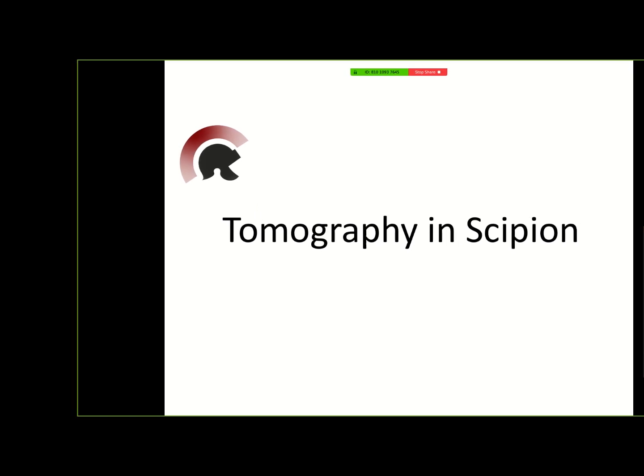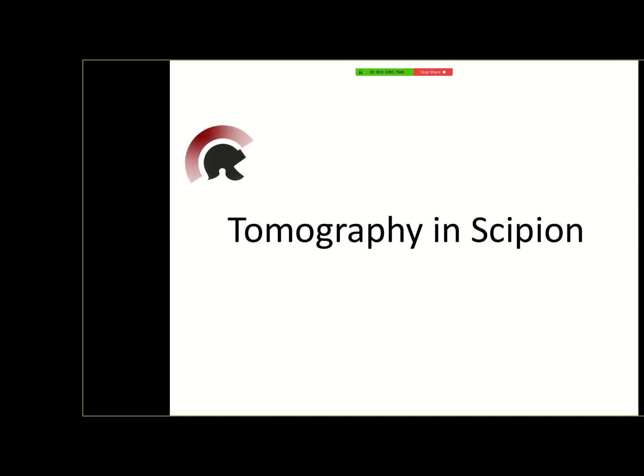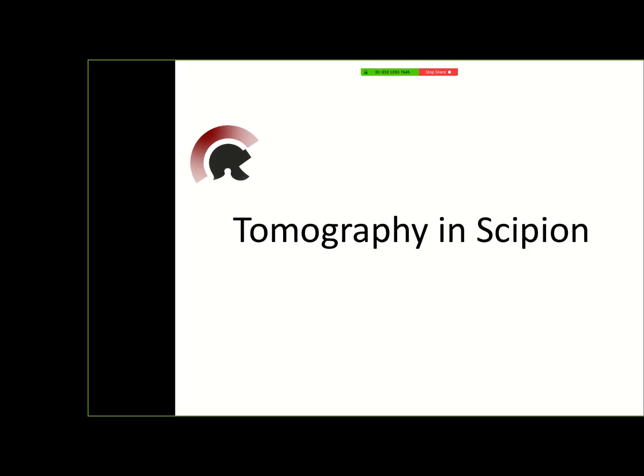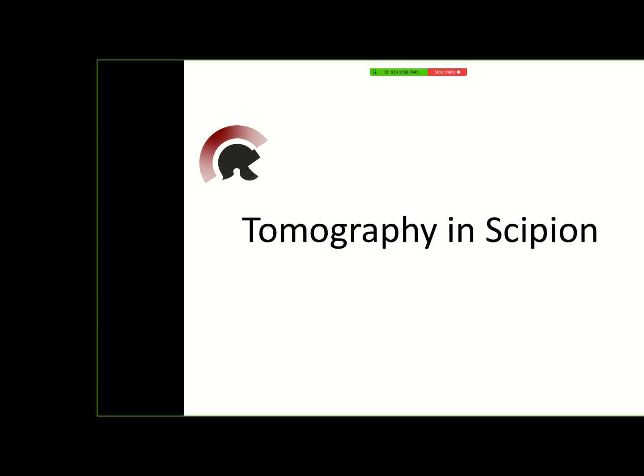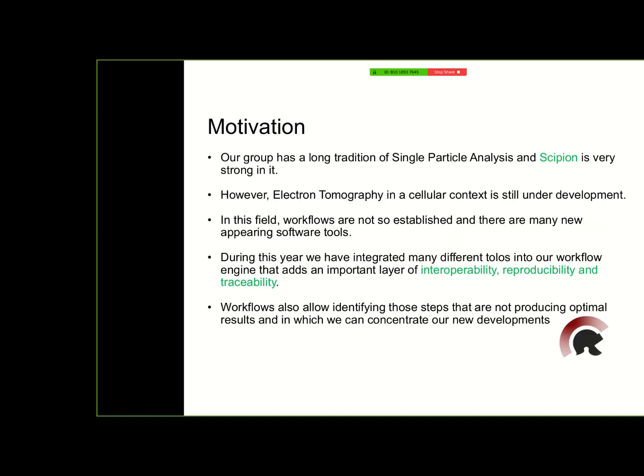Okay, so what I'm presenting is the work of many people in the lab, especially in the context of the ERC project. It is the developments in Scipion to extend to tomography and to define workflows in tomography image processing. And I assume that all of you are familiar with tomography, so that I don't have to explain that part. So I will just explain what are the possibilities in Scipion.